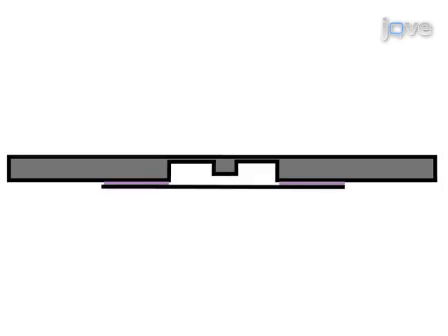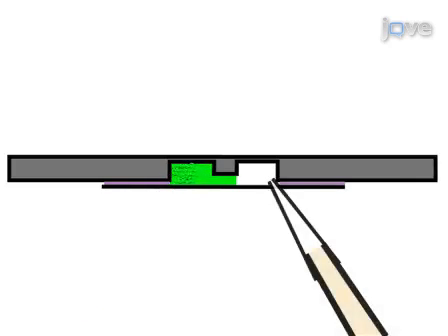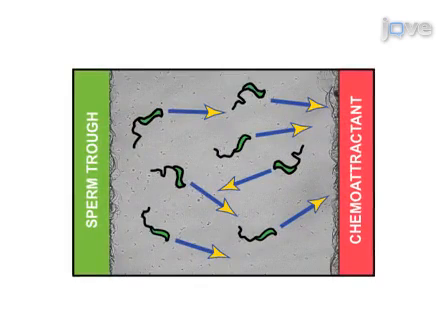For the Siegmund chamber tracking assay, a cover glass is first applied to the Siegmund chamber with silicone oil and placed upside down over the circular opening of a microscope stage. One side of the trough of the chamber is then filled with activated frog sperm. Next, the other trough is filled with the chemoattractant solution. After 5 minutes, the chemotactic gradient forms, and at this time, the sperm can be videotaped swimming along the gradient.